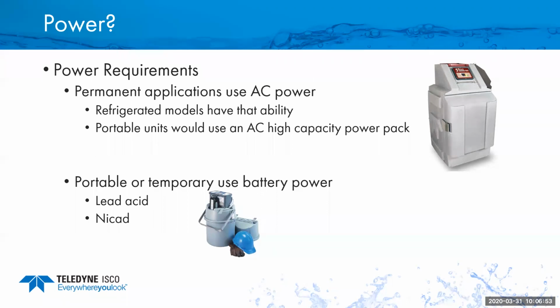For both lead acid and NiCad batteries, a full charge takes about 16 hours. We get a lot of people charging batteries for only like 12 hours or something like that, and then the battery slowly starts to not perform like they want it to. So you definitely have to charge them at least 16 hours.